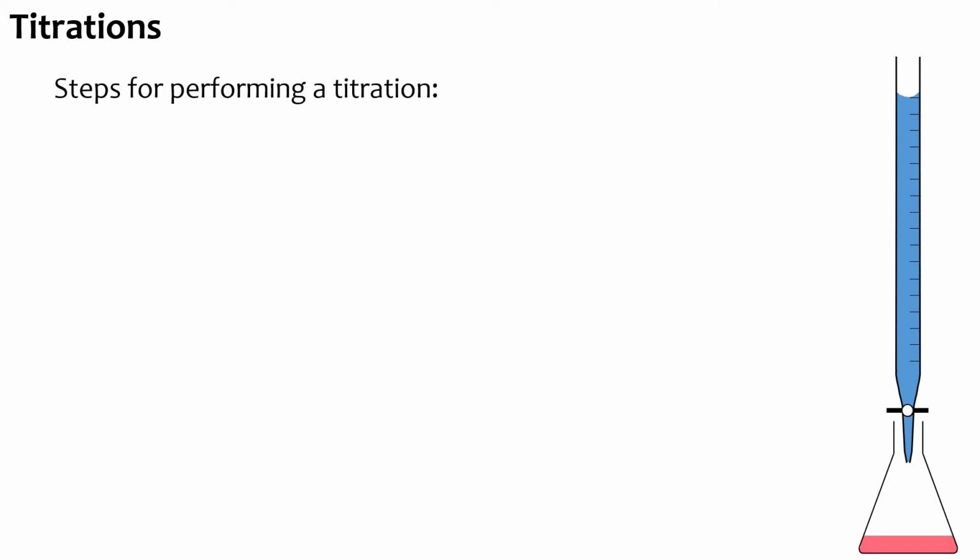So steps for performing a titration. This is a very brief overview of how you'd perform a titration. There are lots of other things you'd need to consider in terms of setting up the burette. You need to make sure that you're rinsing equipment and all that kind of stuff. But this is an extremely brief overview just as a reminder.